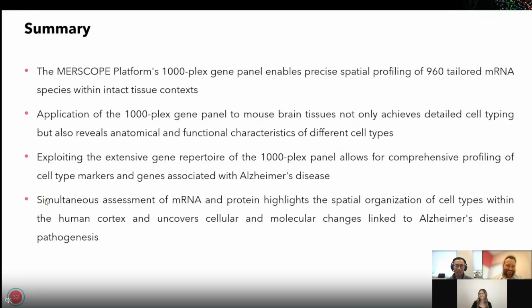Okay, so now the limitation is like 1 square centimeter. As long as you can put multiple tissues on the same Merscope slide, finally you can image up to 1 square centimeter region. That includes multiple subregions if you can have multiple tissues.